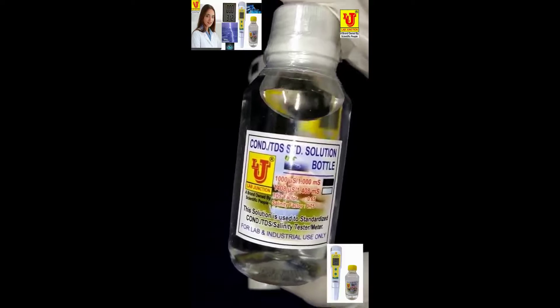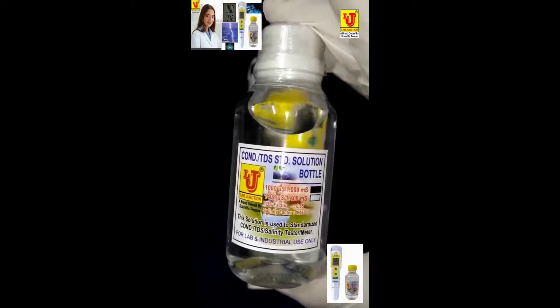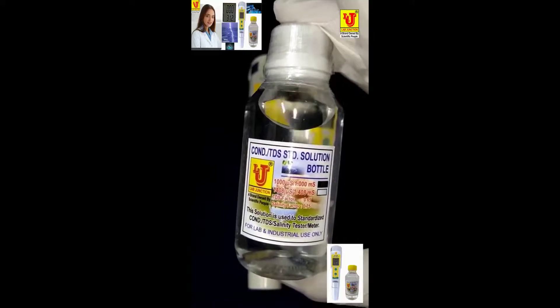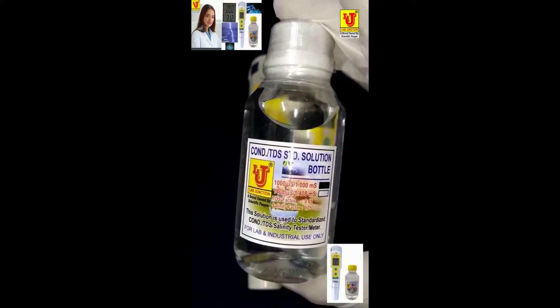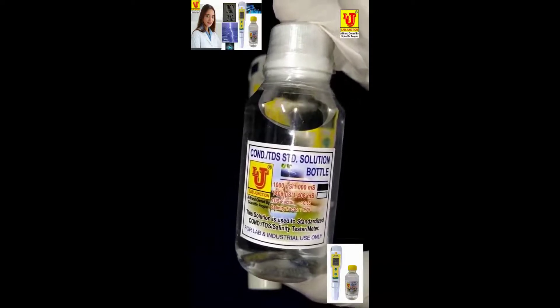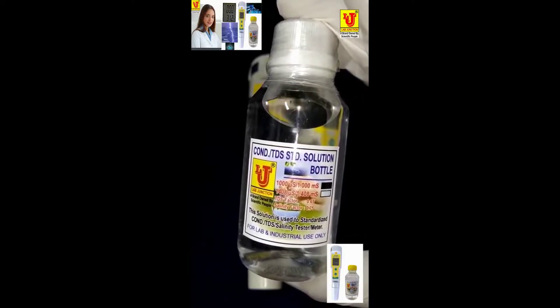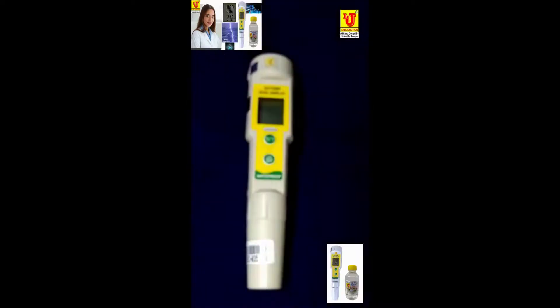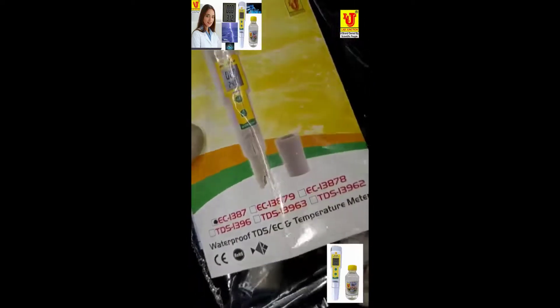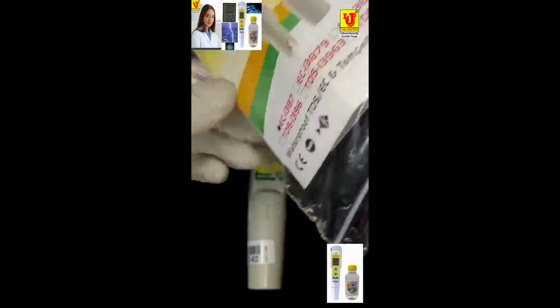This standard solution is for calibration of the waterproof EC temperature meter LJ EC035. We deliver this operation manual.